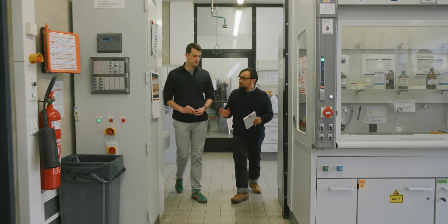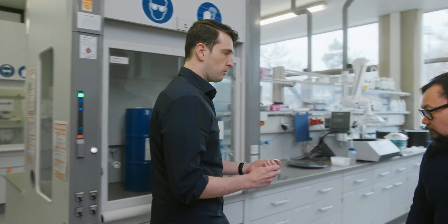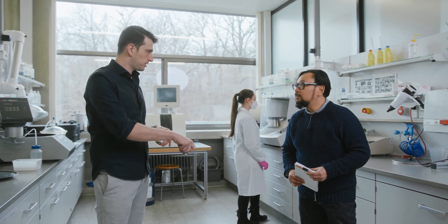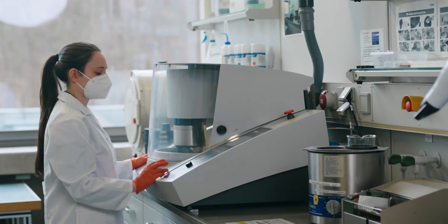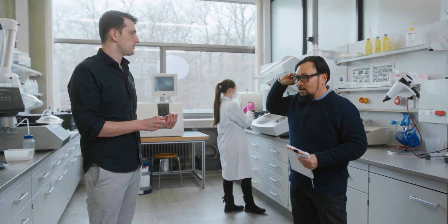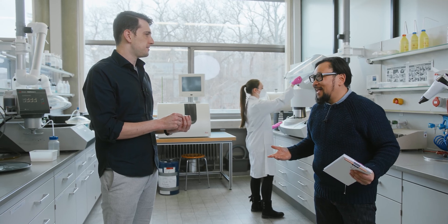So I understand there's more preparation involved in making these samples. What are we going to do next? Next we have to put the battery piece into some epoxy resin to fix it and fixate the microstructure from breaking out. Then we put the sample into one of these sample holders and grind it over grinding paper to get a much smoother, polished surface. We go from different grits to finer paper or finer grinding suspensions with diamonds in it. So we take the battery sample, put it in resin, and grind it to get a really smooth surface to take an image. Exactly.